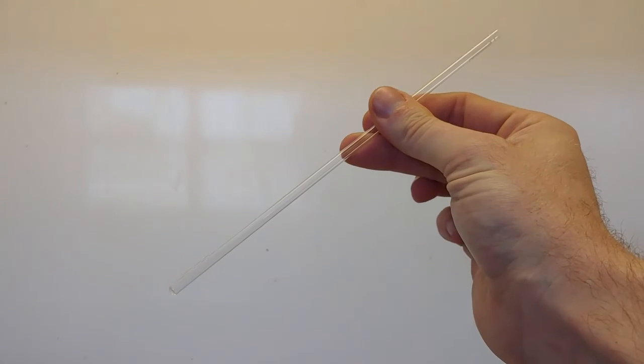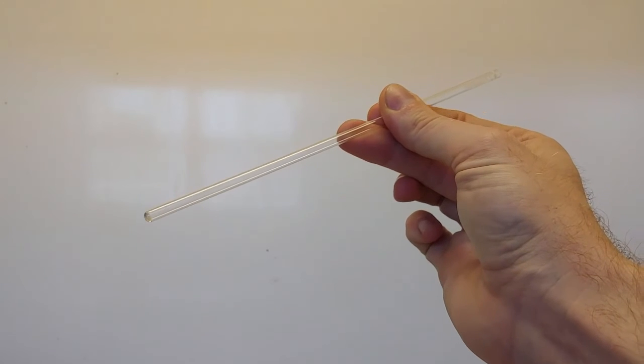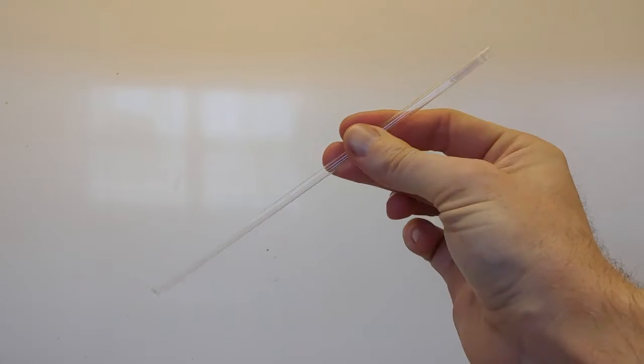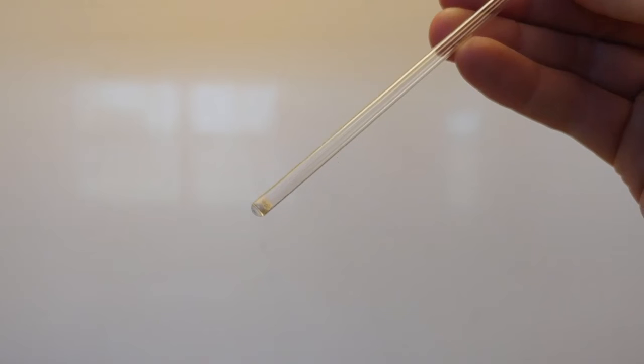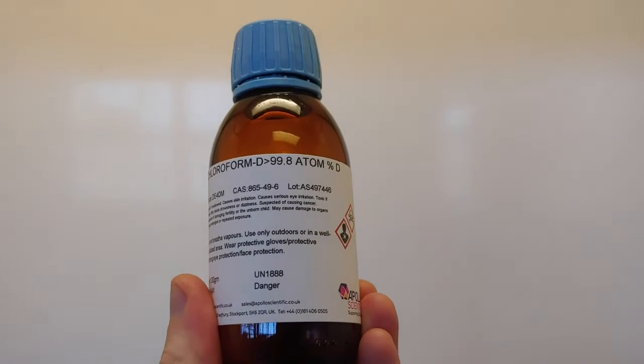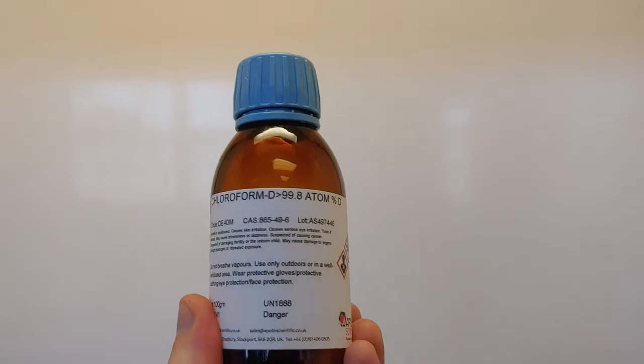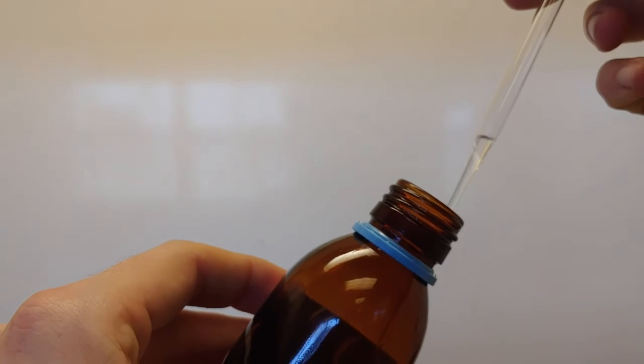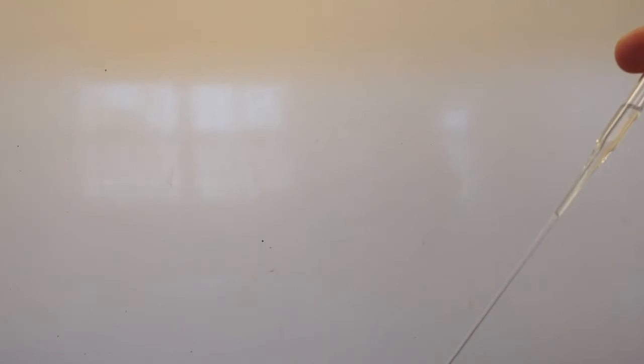To actually run an NMR spectrum first we'll need an NMR tube and this is basically a very long thin glass test tube. We load our sample in there, you can see it as a powder, you generally only need about 10 milligrams. And then we use a deuterated solvent, so this is a solvent where all of the proton nuclei have been replaced with deuterium because deuterium doesn't show up in a proton NMR spectrum.